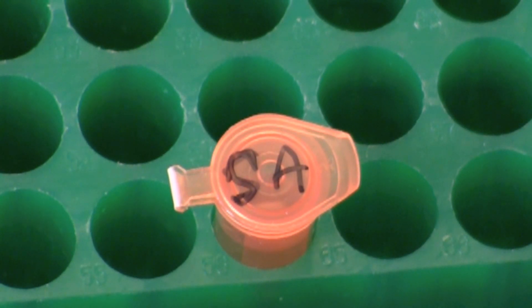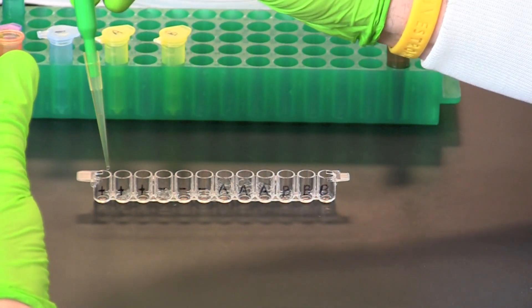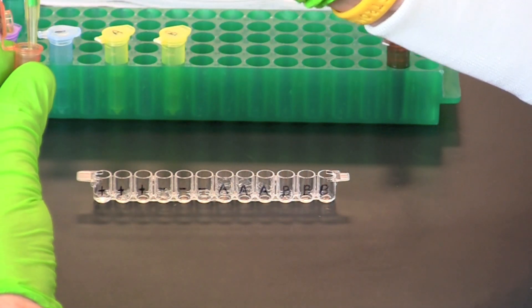Use a fresh pipette tip to transfer 50 microliters of secondary antibody, or enzyme-linked antibody, into each well of the microplate.